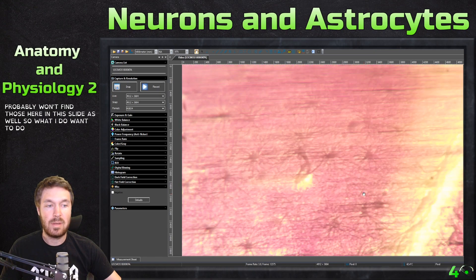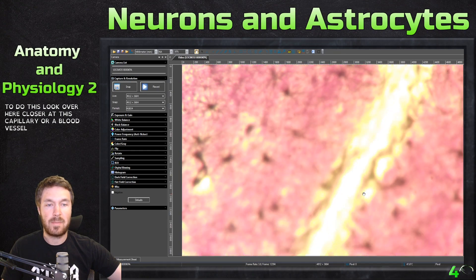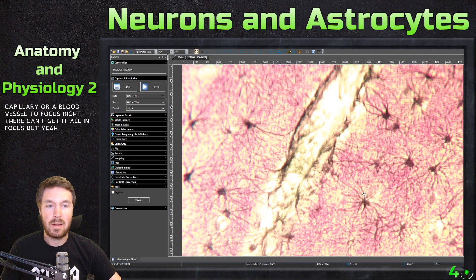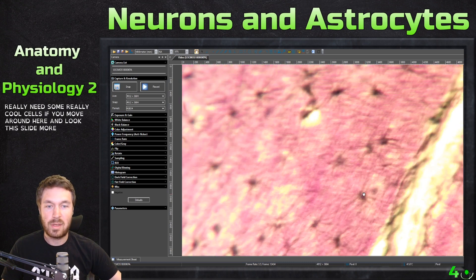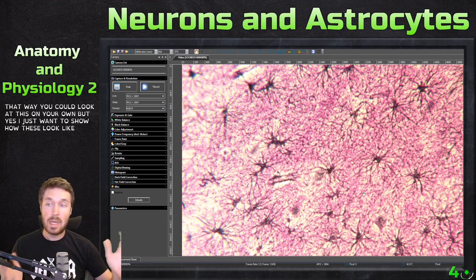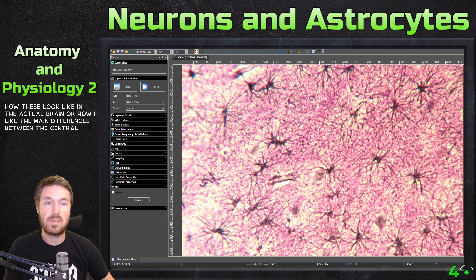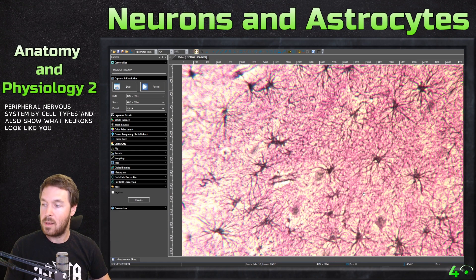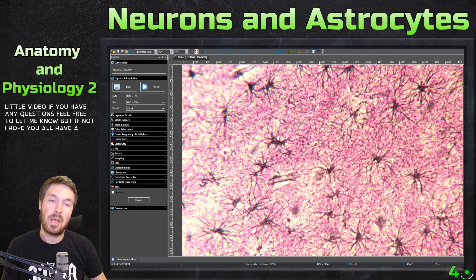Let's look over here closer at this capillary or blood vessel. I'm changing the focus — can't get it all in focus, but it's really neat. Some really cool cells if you move around here and look at this slide more. I wish we did have this in the laboratory so you could look at this on your own. I just wanted to show how these look in the actual brain, highlight the main differences between the central nervous system and the peripheral nervous system by cell types, and show what neurons look like. If you have any questions, feel free to let me know. I hope you all have a great day — bye-bye.